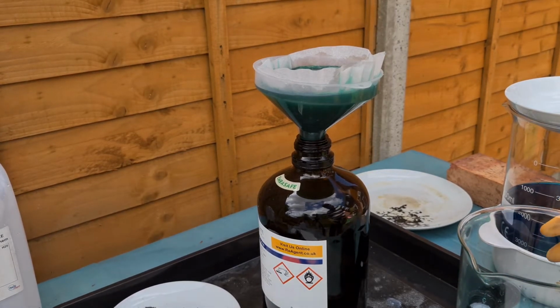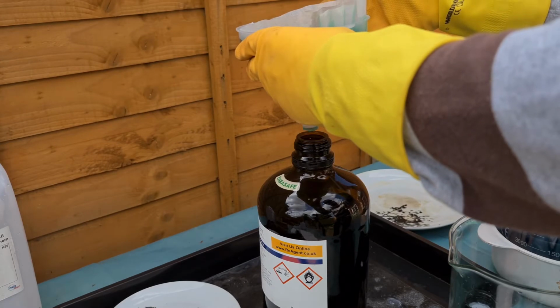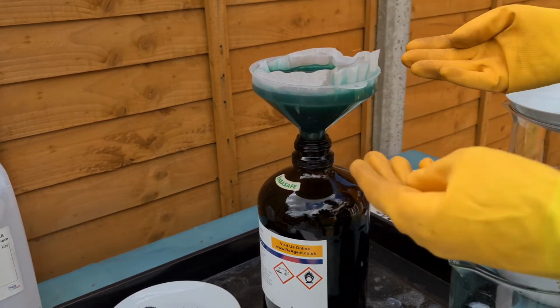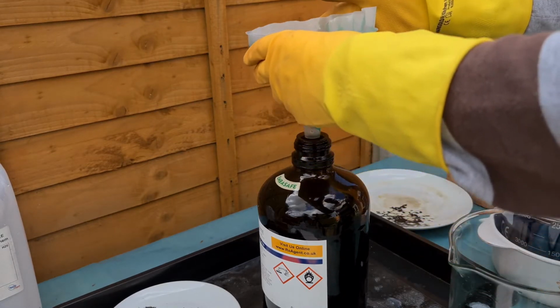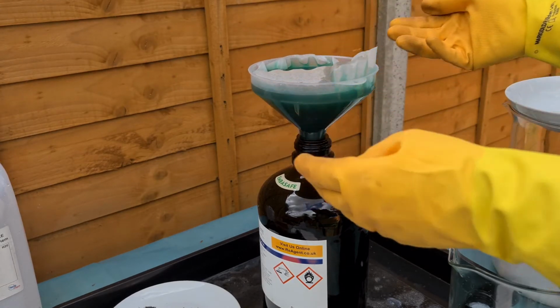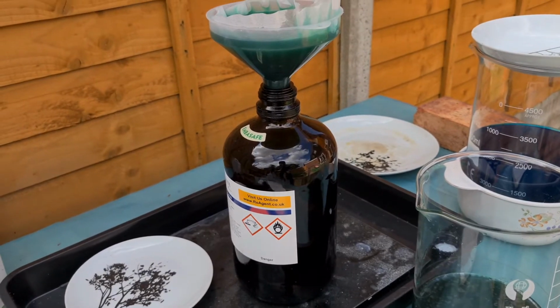Because that's going to have sediment at the bottom. See if you can. No, you can't, but that's going to have sediment at the bottom that's going to contain gold. Okay, so it's going to take a while to filter. It's really going to take a long time actually. Okay, so I'll get back to you when that one is done filtering into there. Okay, so just bear with me.